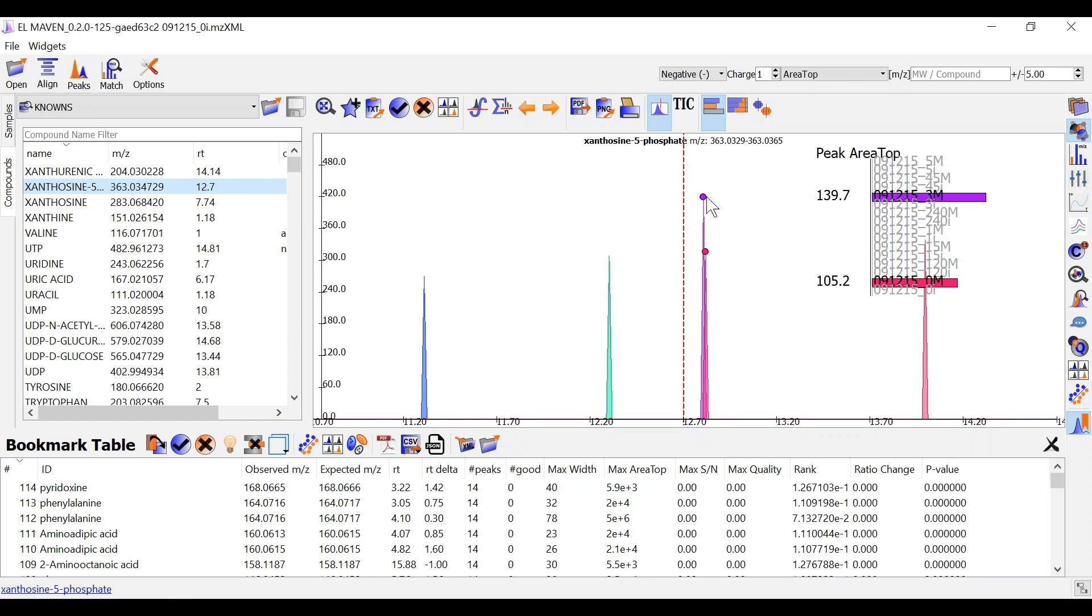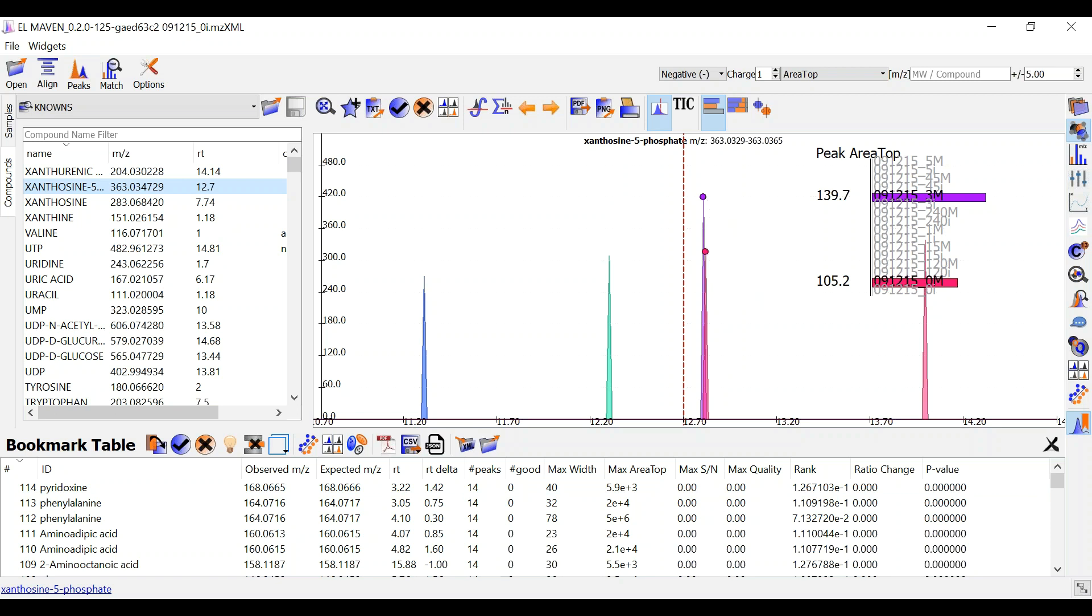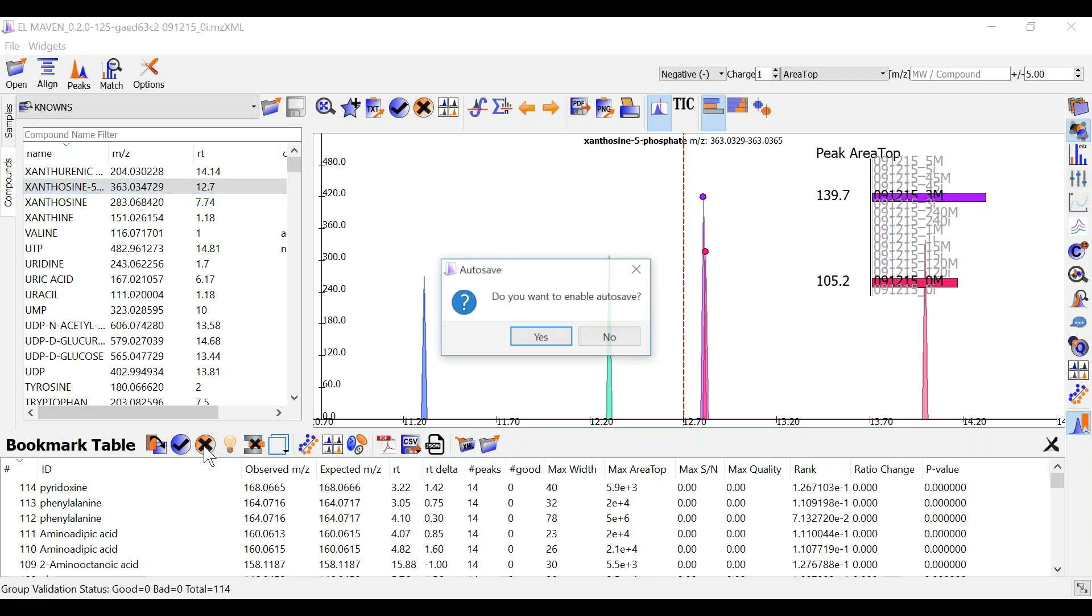You can mark these samples as good or bad according to your judgment by using this button. You can mark a group as bad.